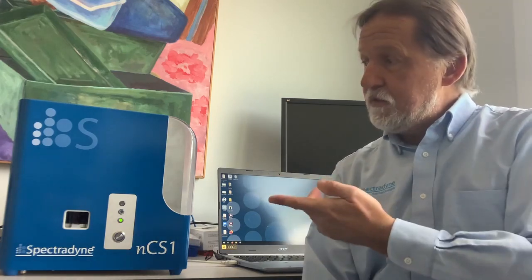Good day, my name is Lou Brown, I'm with Spectradyne, and today I would like to give you a brief demonstration on how our NCS-1 nanoparticle analyzer works.